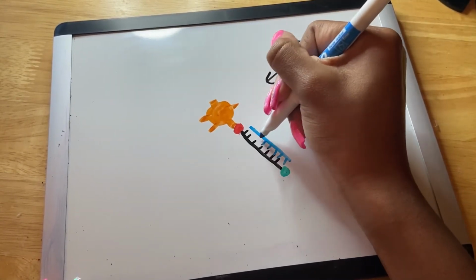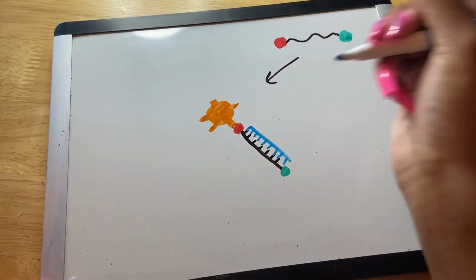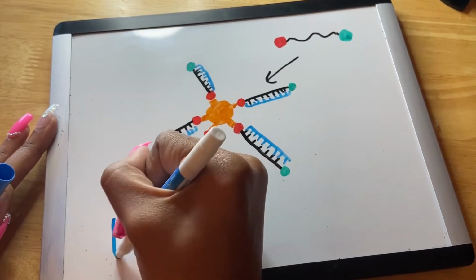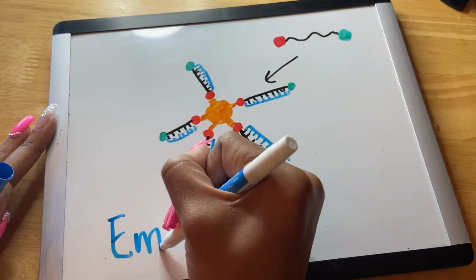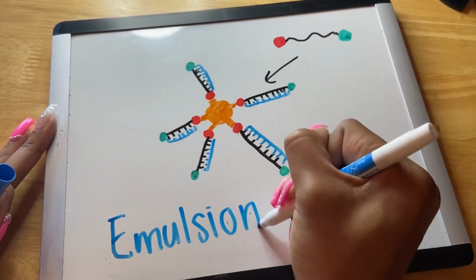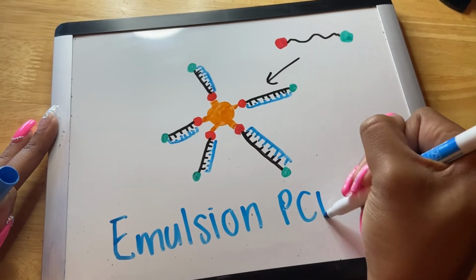It makes a complementary strand. And what that means is if on your regular strand, the black one, you had an A, you would make a complementary strand of a T. And if you had a C on the black strand, you would make a complementary base of a G. The next step to achieve those repeated strands on that bead would be emulsion PCR.